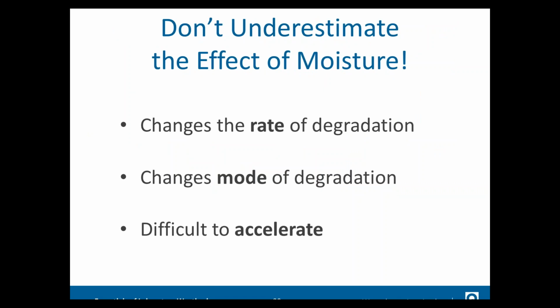If there's anything that you take away from this presentation, it's that you shouldn't underestimate the effects of moisture. It really changes the rate of degradation because it facilitates those reactions in solution. It changes the mode of degradation for a lot of materials, and it's very difficult to accelerate. As we always say, it's hard to actually have water sit on a panel faster.